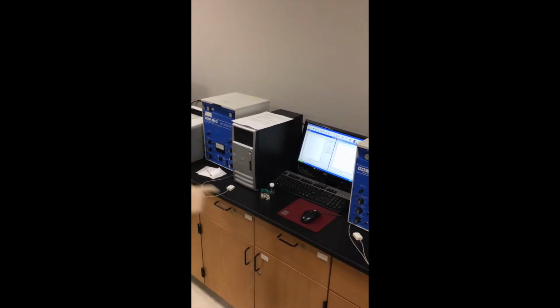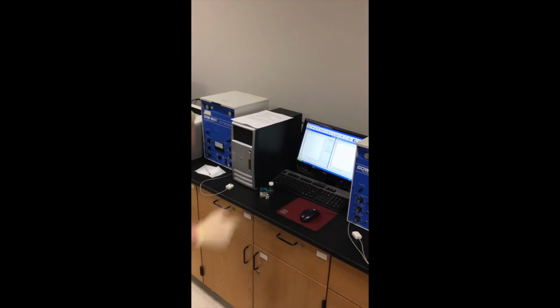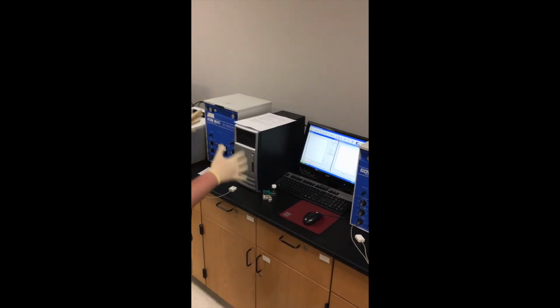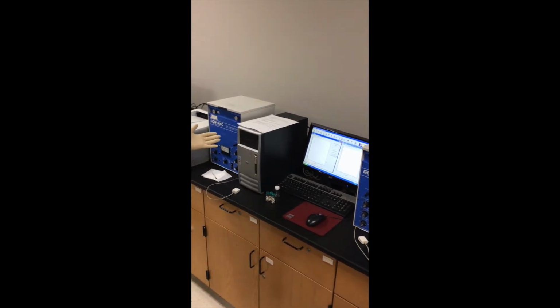And then in between each one of these chromatographs, we have a computer. So there's 2 here and a computer, 2 there and another computer, and the information is fed to the computer when you take the chromatograph. Ideally, all of this will already be on before you get to lab. Each one will already be activated and hot and ready to go, and all the computers will be set up. This is what you'll see when you come in here.